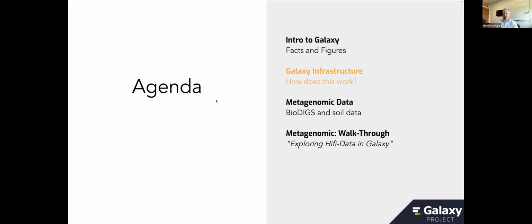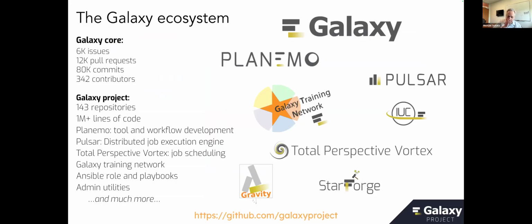Okay, so that's a little bit of the high level of what is Galaxy, and why it's cool. Let me just spend 5 minutes to tell you about how it works, and then we'll pivot into the hands-on exercise. So, when I talk about Galaxy being an operating system for science, there's a lot of software behind the scenes. There's a lot of major systems behind the scenes. I'm not going to go through it in any detail, but the headline is it's all open source.